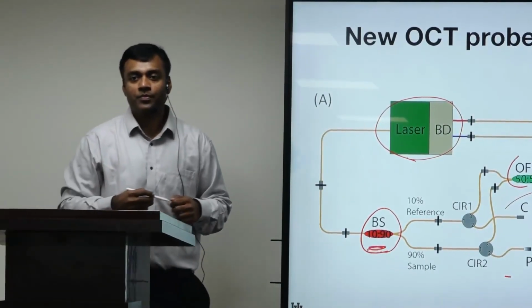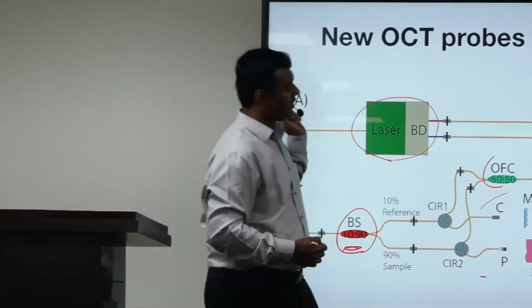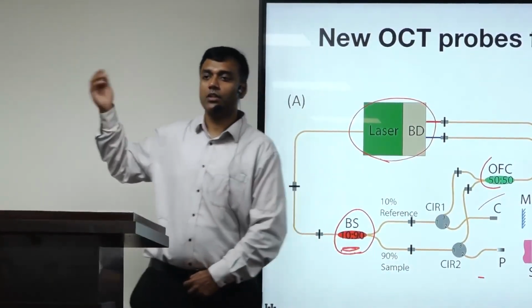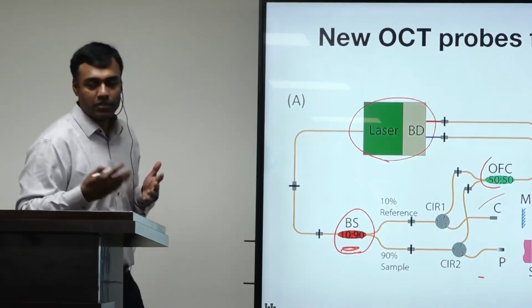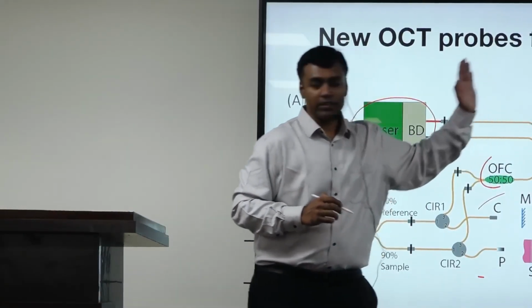Applying a voltage, there are wires which are soldered onto the piezo and go through this tube all the way to the outside, and we have a function generator, amplifier and a piezo controller on the outside, and depending on the voltage it will deflect.